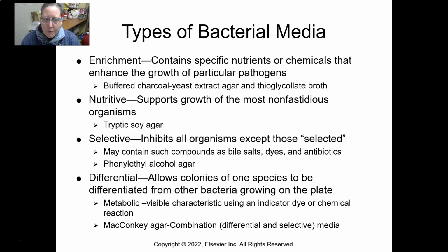Nutritive media support the growth of most non-fastidious organisms. So tryptic soy agar is one of them. Like blood agar is tryptic soy agar with blood added to it. But a nutritive is just a regular tryptic soy agar. You can buy just that, and most organisms that are non-picky eaters, non-fastidious, will grow on it.